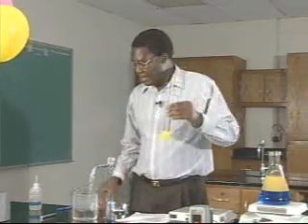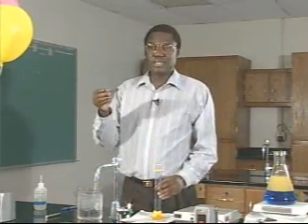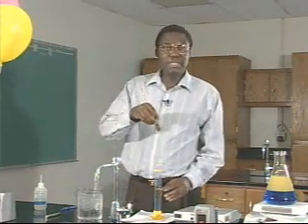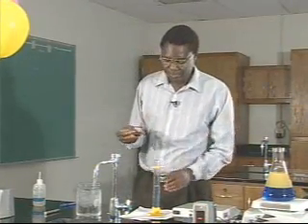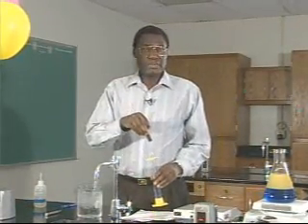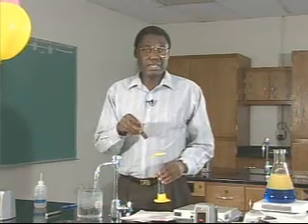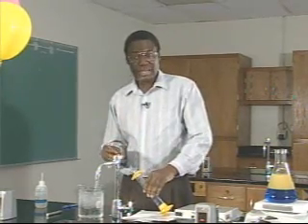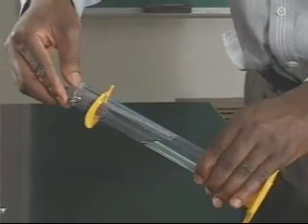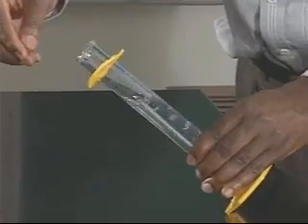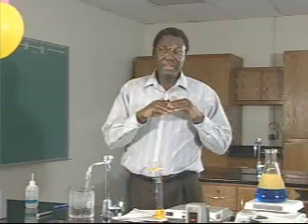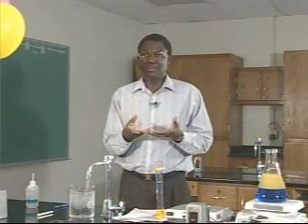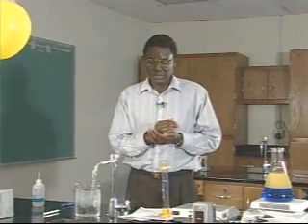Once you've taken the initial reading, immerse your object in the cylinder. Make sure it is completely covered by water. Don't just drop it — you'll break the cylinder. Instead, tilt the cylinder and let the object slide in gently. Don't tilt too much or you'll spill the water. Remember, you've already recorded the initial volume, so you don't want to spill any water.